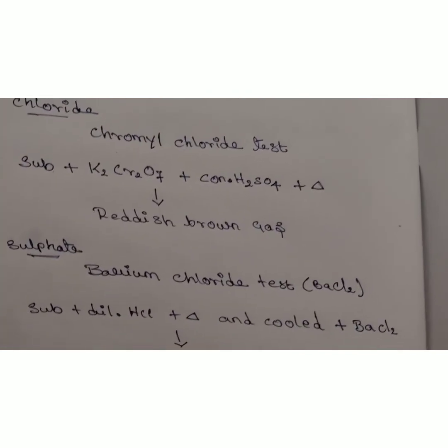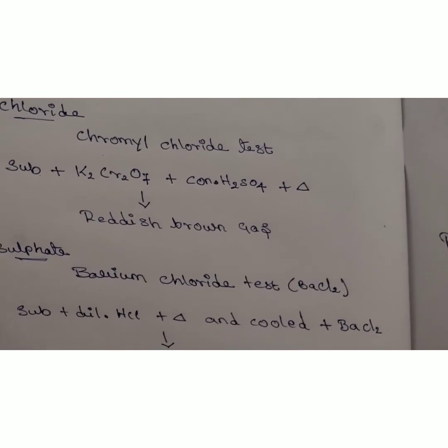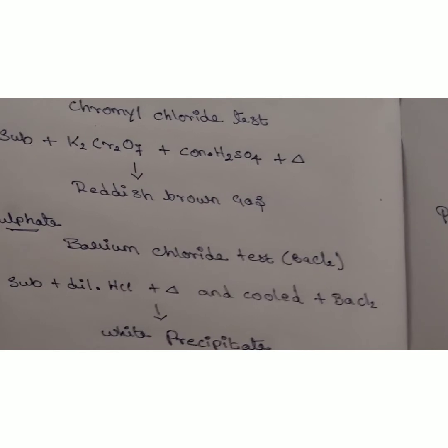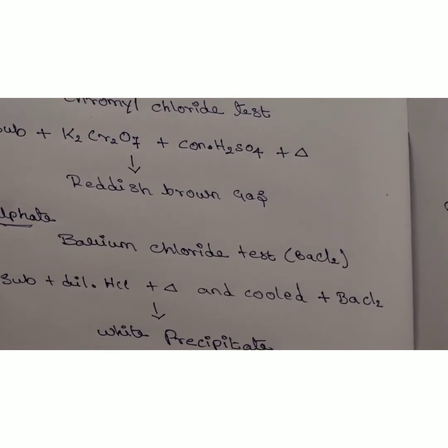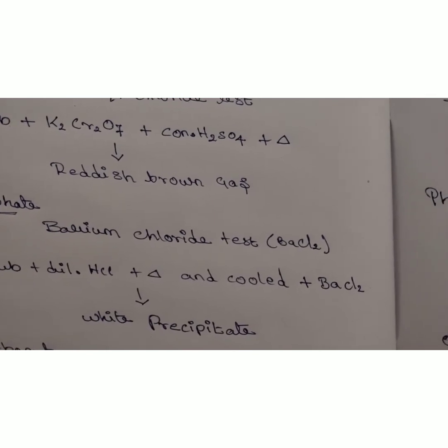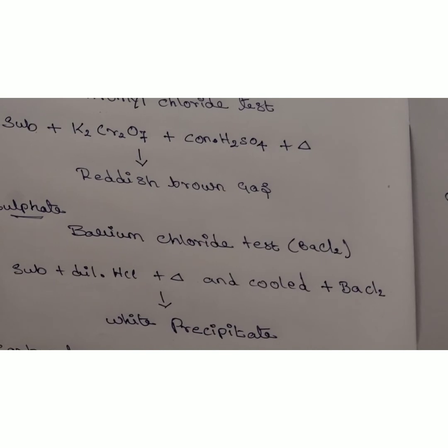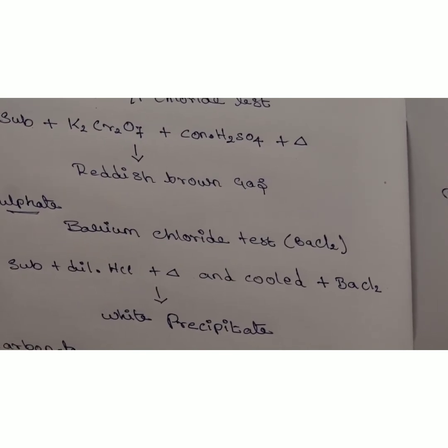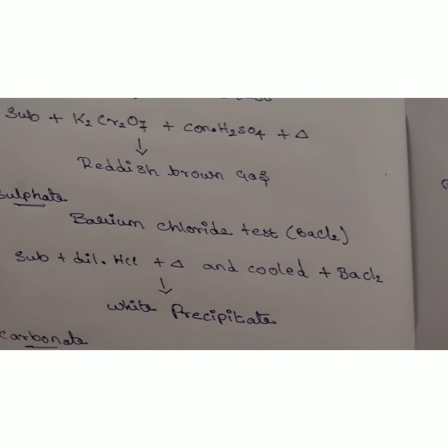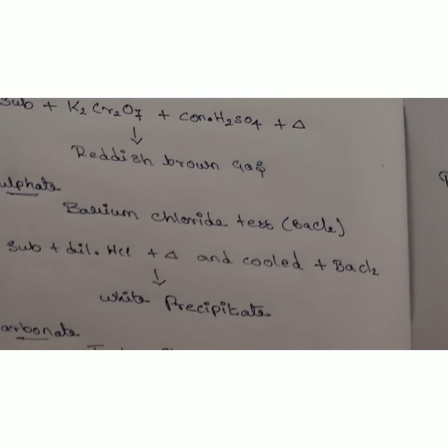Next we are going to sulfate. Barium chloride test, BaCl2. The substance is dissolved in dilute hydrochloric acid solution and it is heated and cooled. After cooling, the barium chloride solution is added to get a white precipitate. The white precipitate confirms the presence of sulfate.